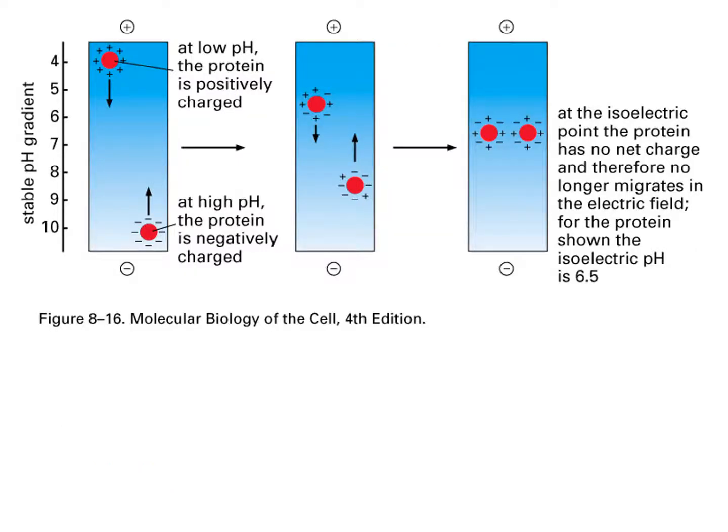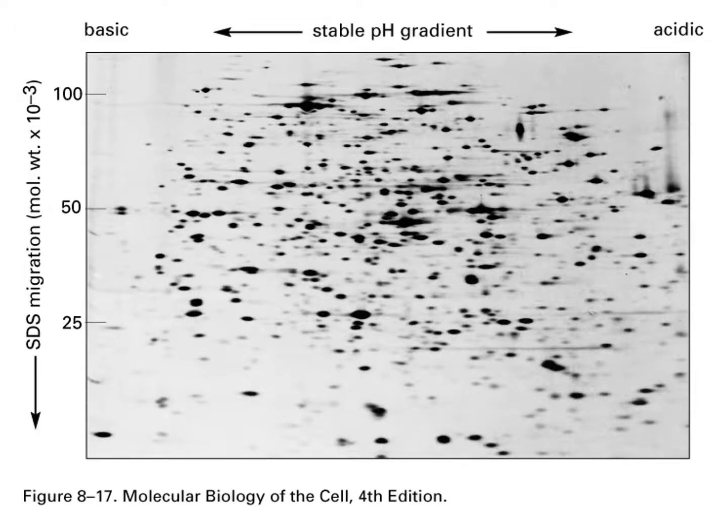So here's just the isoelectric focusing. I just found another picture, and it's pretty blue, showing the gradient. See the gradient concept from positive to negative charges here. And then here's basic amino acids, peptides, basic proteins, acidic proteins. And here's the separation. So these are high molecular weight acidic, basic, high molecular weight, acidic, low molecular weight, basic, low molecular weight, acidic. And these proteins would kind of be neutral here, right? So high, medium, and low.